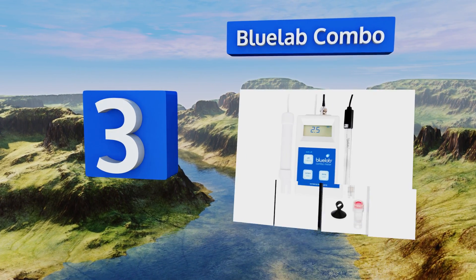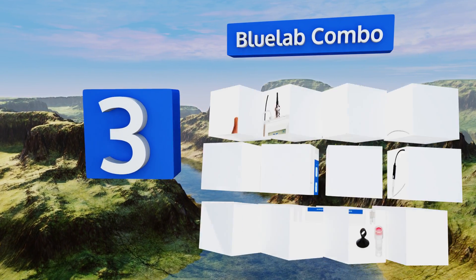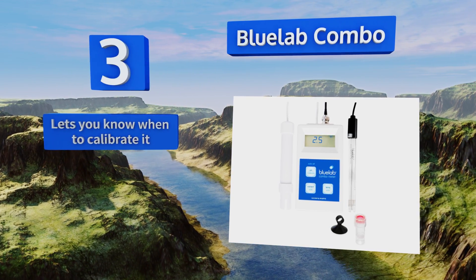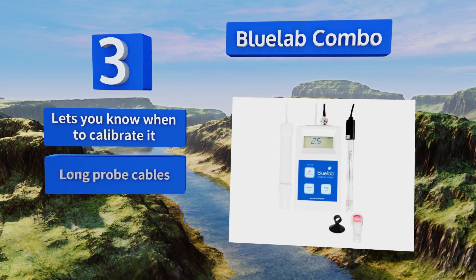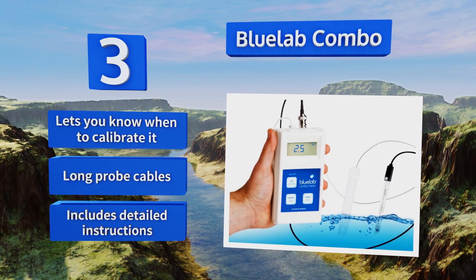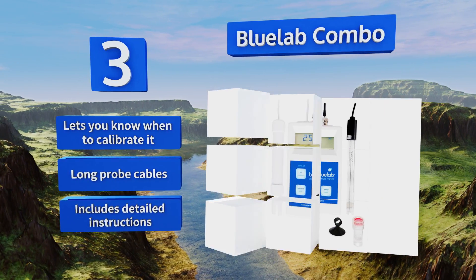Nearing the top of our list at number three, the Bluelab Combo may be overkill for home use but is invaluable in commercial settings. It has a replaceable dual-junction probe and measures every important water variable for plant growth and seed germination. An auto-off feature ensures you don't waste the batteries. This one lets you know when to calibrate it and includes long probe cables and detailed instructions.